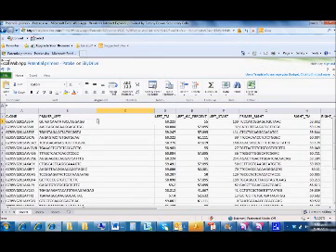Just to find out if I've got any contiguous bases, or more than 3 G's or 3 C's in a row, so that I can make sure I'm really accurate about the primers that I eliminate, and also really efficient rather than having to count them through. You could do that with pretty much all of those criteria as well. Think of how you can use Excel to screen the data for you so you can identify really accurately whether you've got the right primers or not.